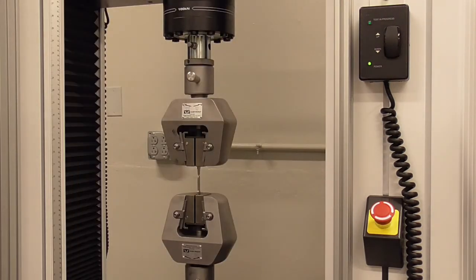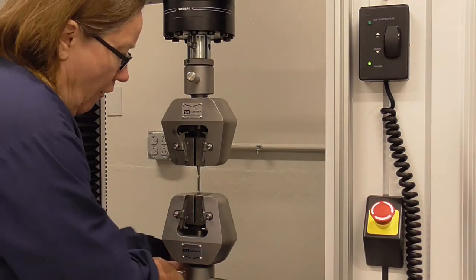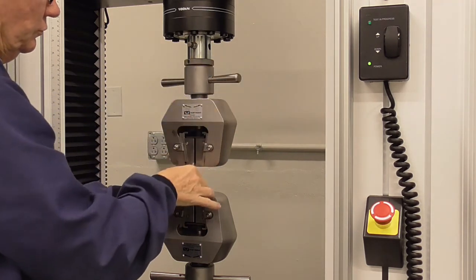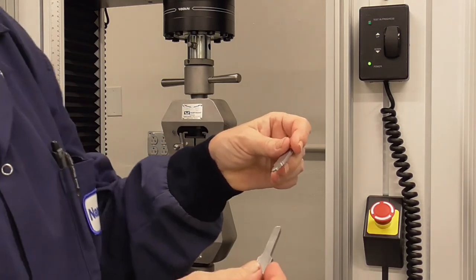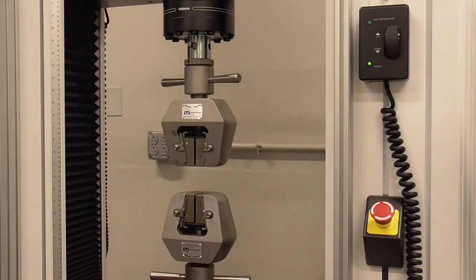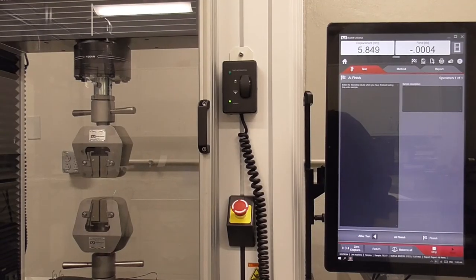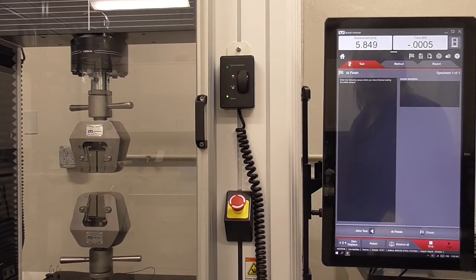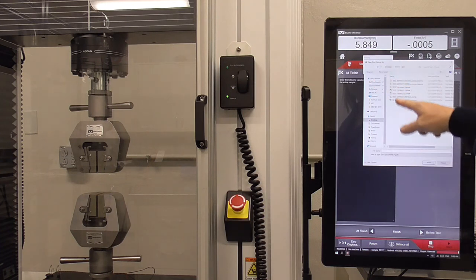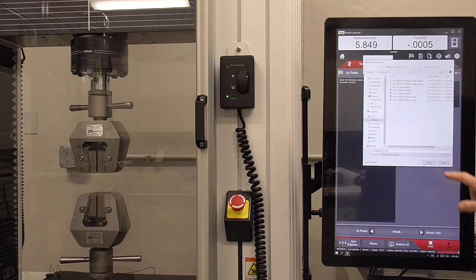Remove the dog bone by opening the door and loosening the grips — the broken pieces should come out. Once the dog bone is out, hit finish. It will ask where you want to send the report; give the report a name on the keyboard and it will save to the desktop.